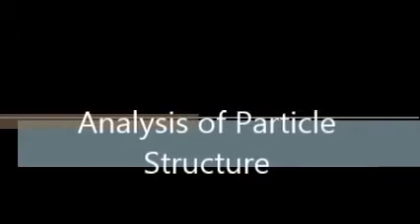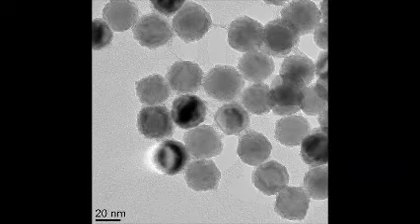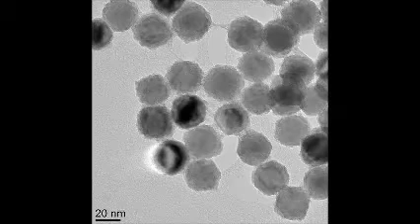To analyze the particle structure, we first must look at the TEM image. The particle consists of a spherical shape. The diameter of one particle is approximately 20 nanometers.